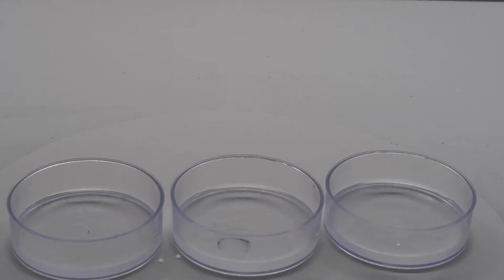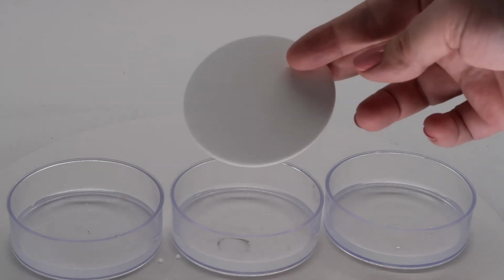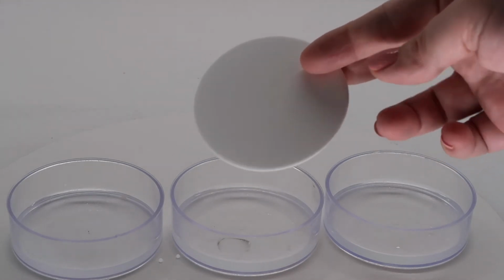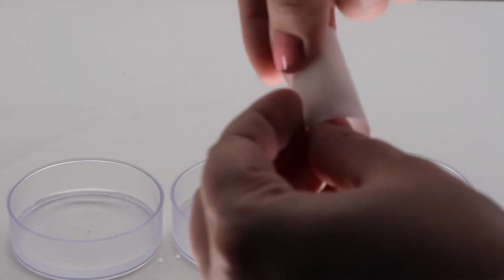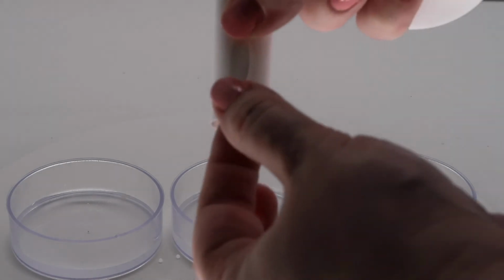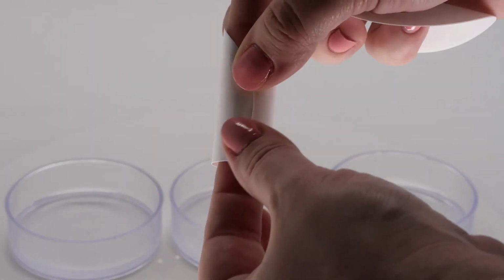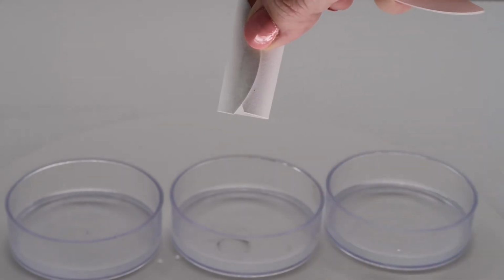Next, prepare the filter paper just as in experiment 32. Put 1 filter paper into each dish. To prepare the paper, cut straight across the bottom to create a flat edge. Then you're going to put your paper around in a circle like that and staple it, or use some sort of bobby pin or paper clip to hold it in this position so that it will stand in the solution.